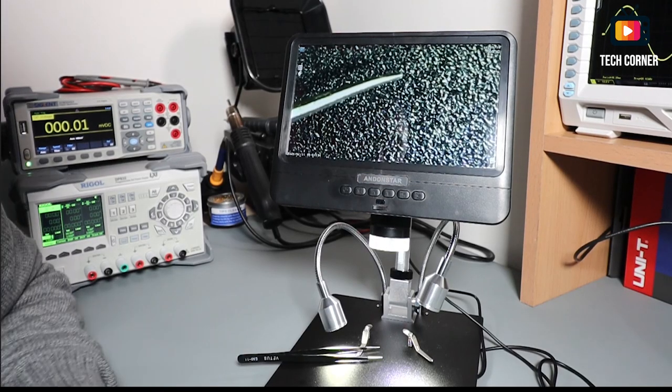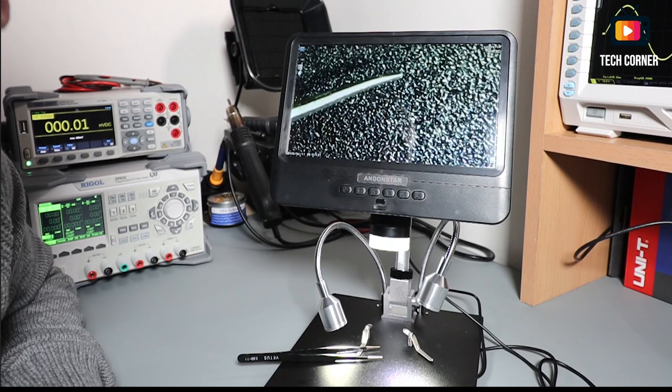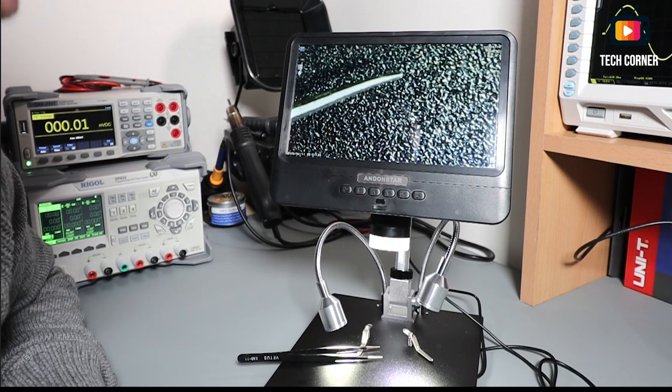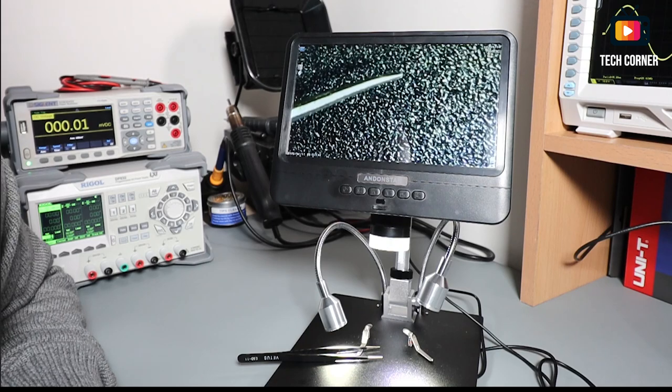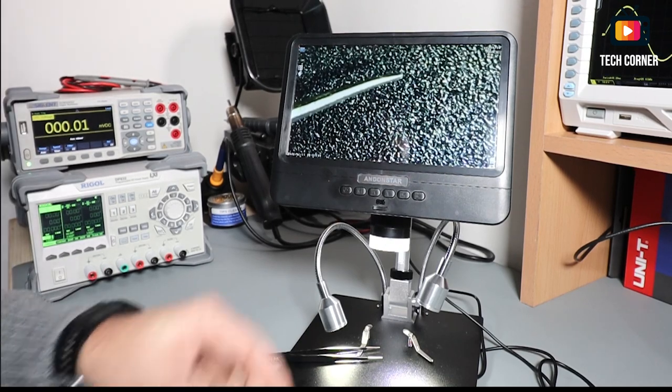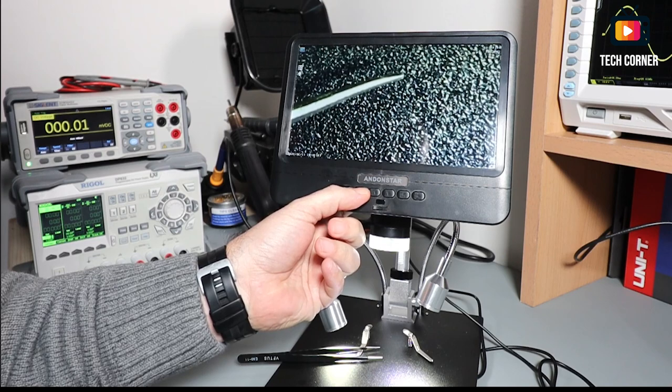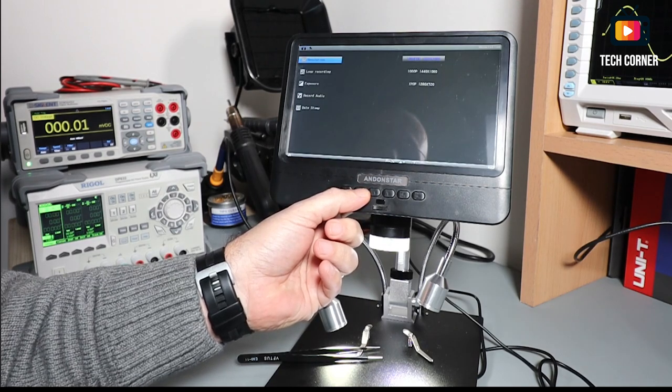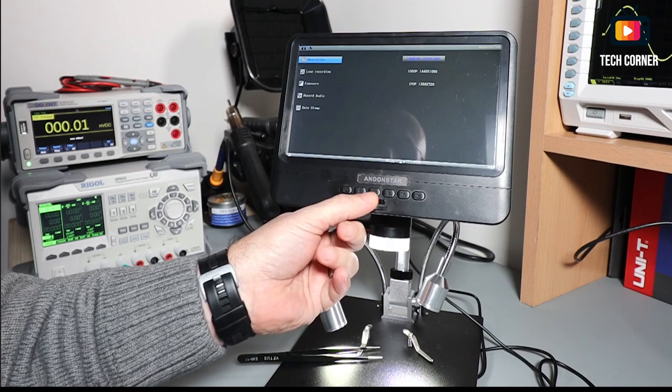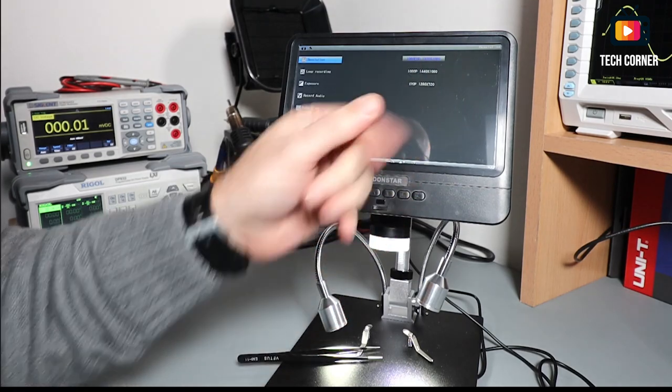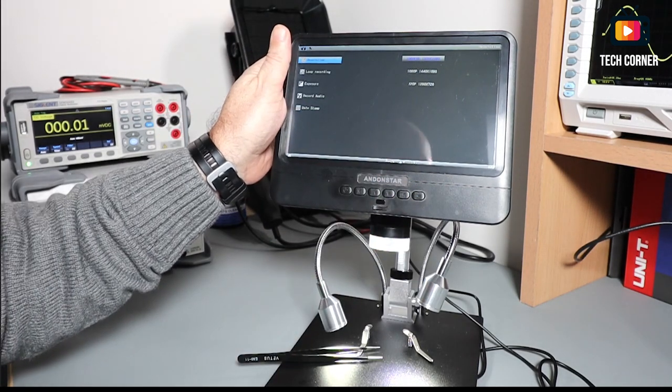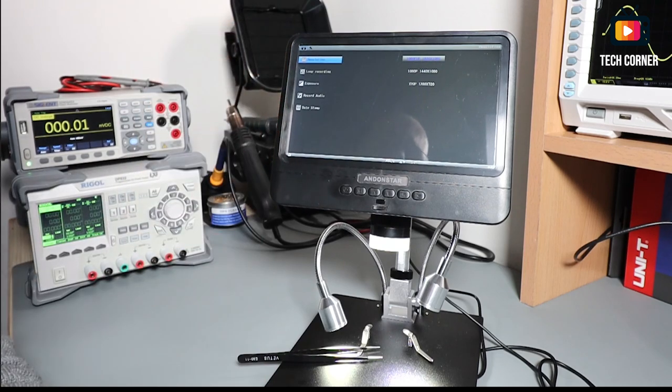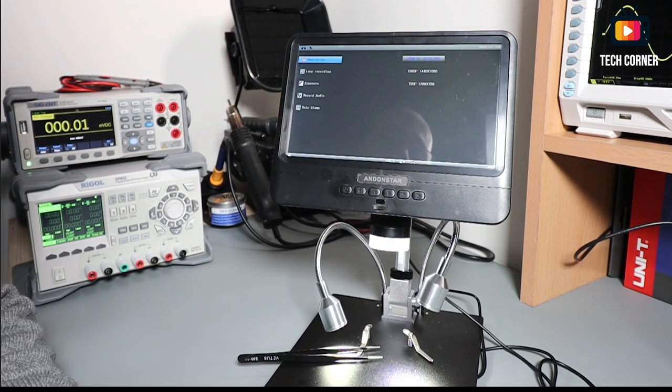So we have here the AndonStar AD208. This digital microscope has some interesting features. Let's start by going to the setup menu. We have several options like resolution. This is the resolution that we can use for saving the recordings on the SD card.